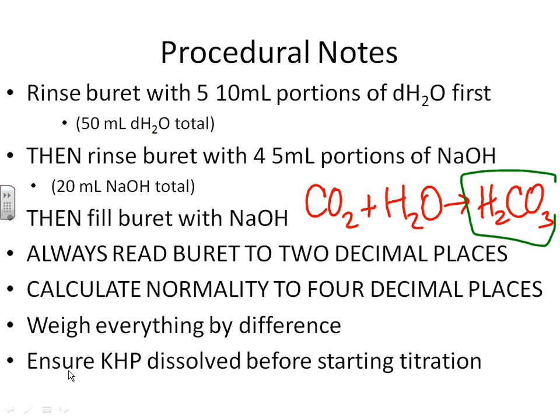I will reiterate the procedural stuff on the day of the lab, but I'm not going to go over the sample calculations because I think that they're well covered here. They're also well covered in your lab handout. Your lab handout goes on about milli-equivalents, and I don't really want you to worry about those quite so much, but it does have general background on equivalents, and it has the formula for normality, and it shows the structure of KHP, so you can figure out the molecular weight from there.